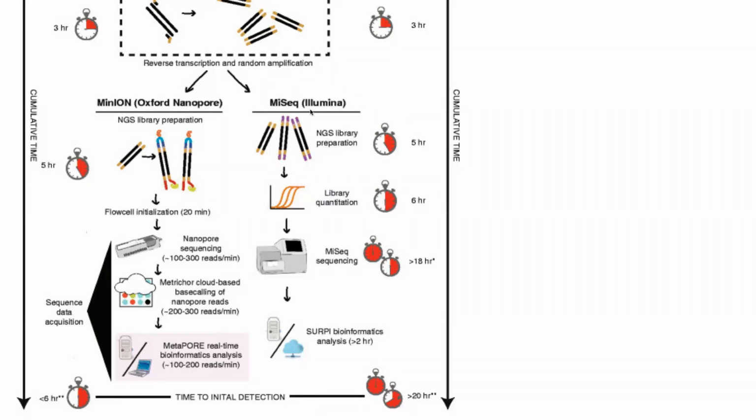So when we compare long read sequencing on something like MinION, which is a handheld device, so you can really take it anywhere, and also it is cheap, one of the major benefits is the time that it takes to identify what is in my sample. So if we think about rapid detection of viruses or pathogens or characterization of what causes a specific effect, this is a very useful method.